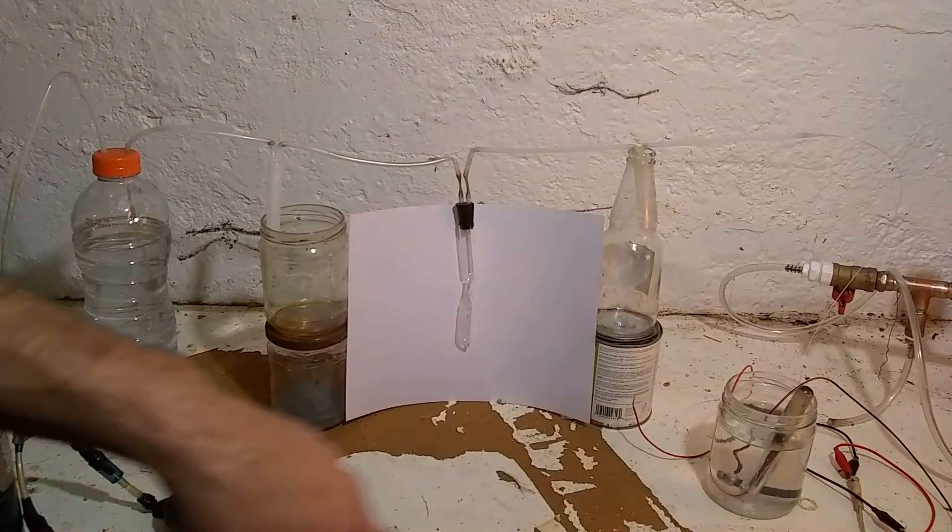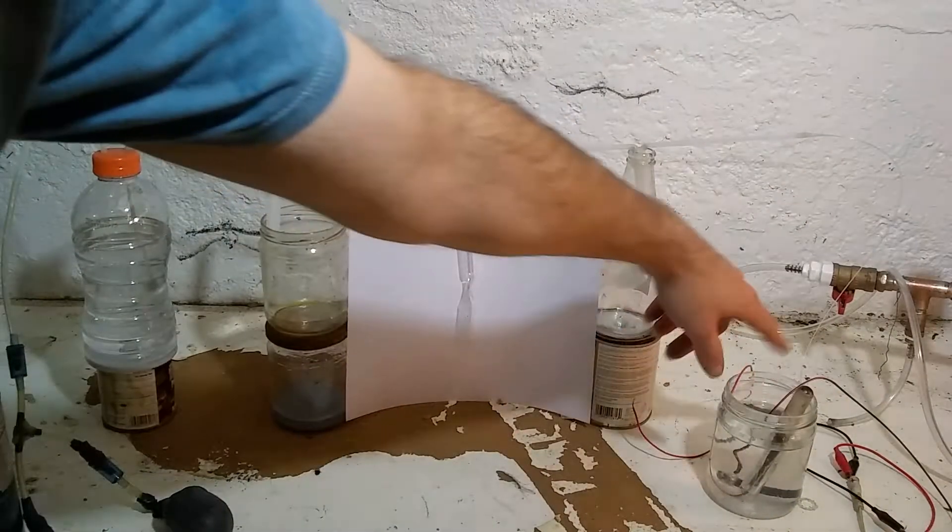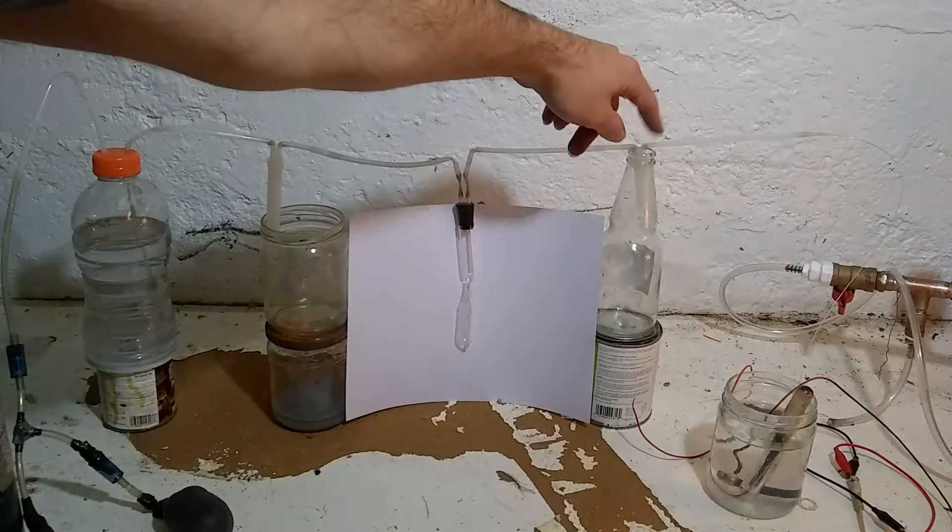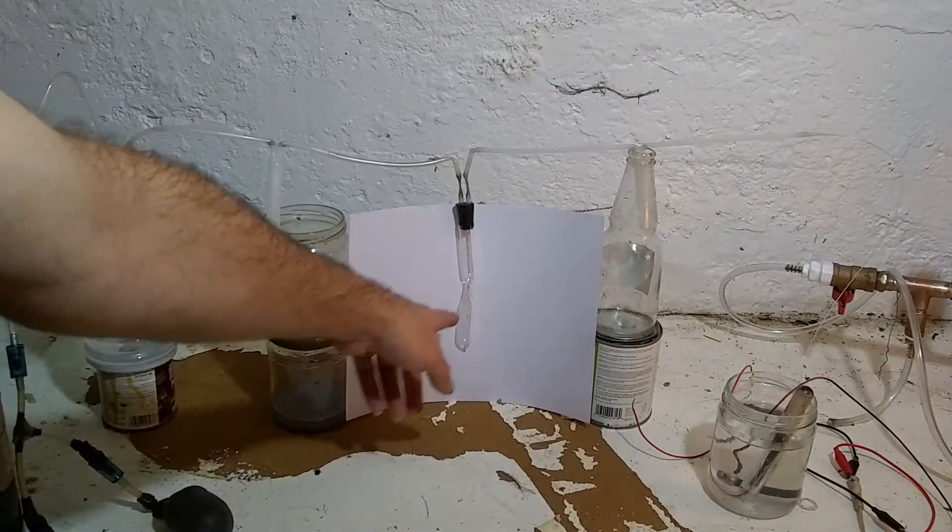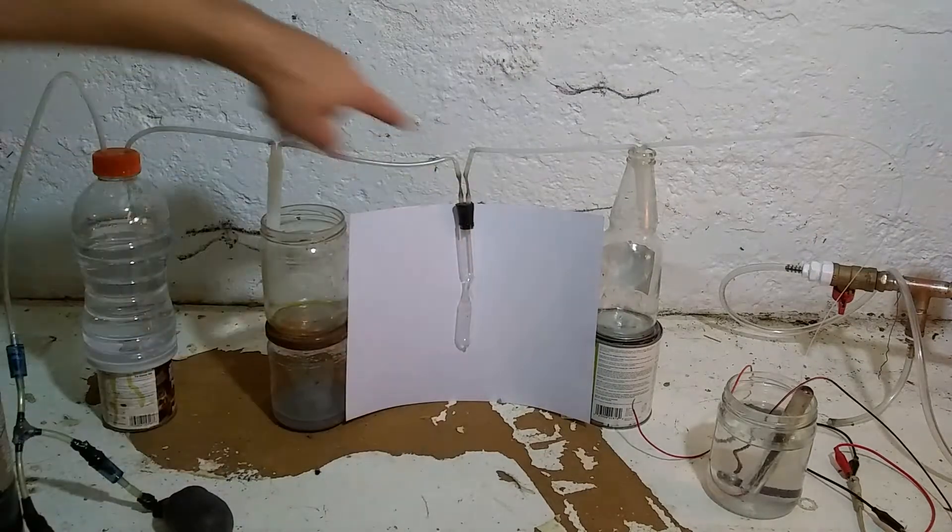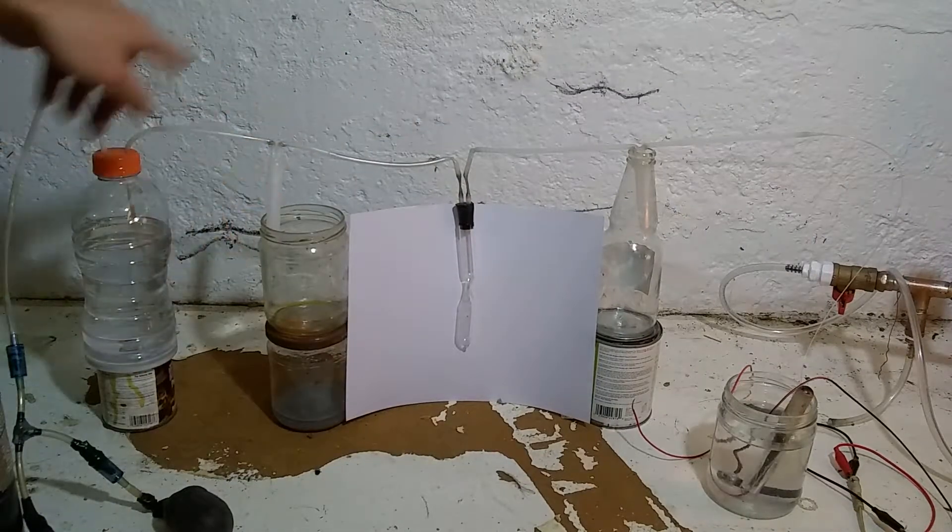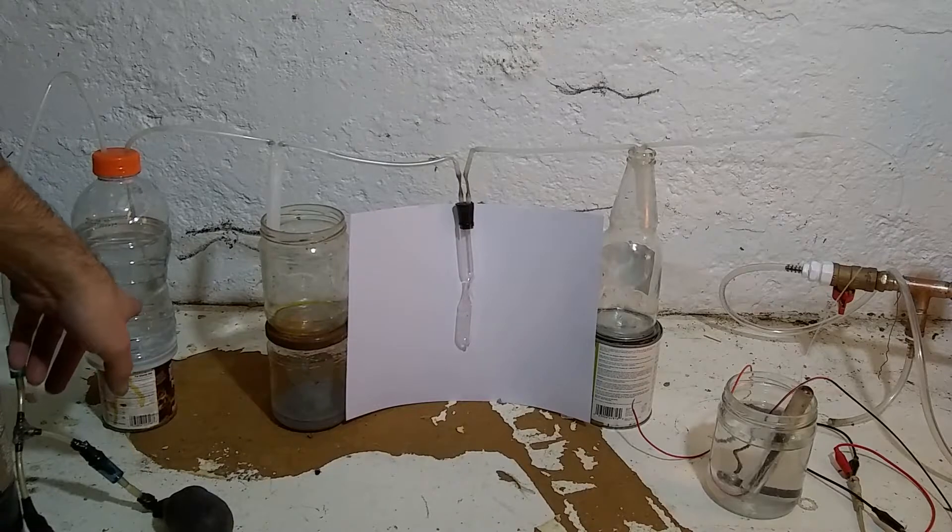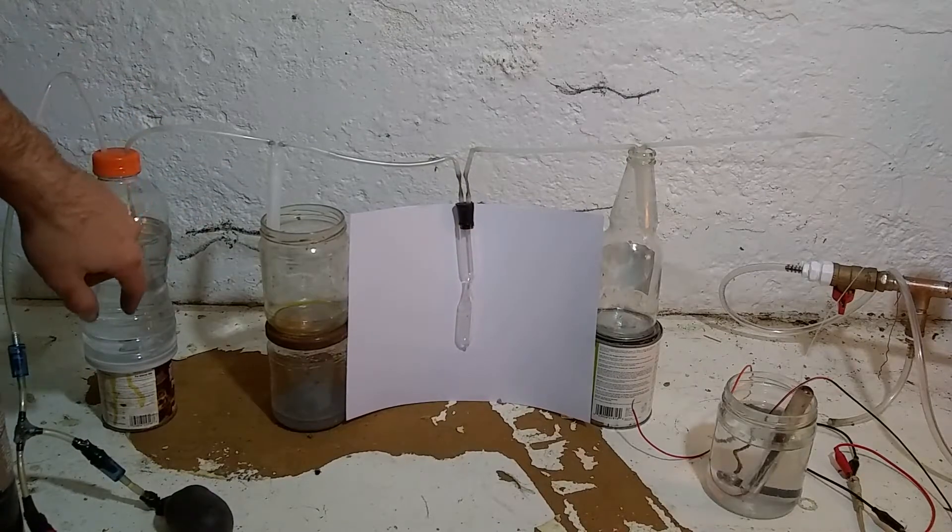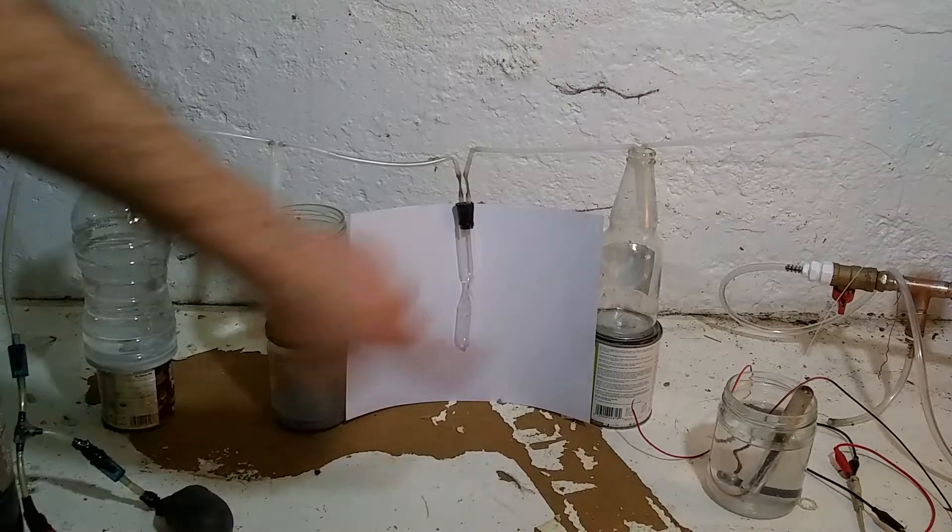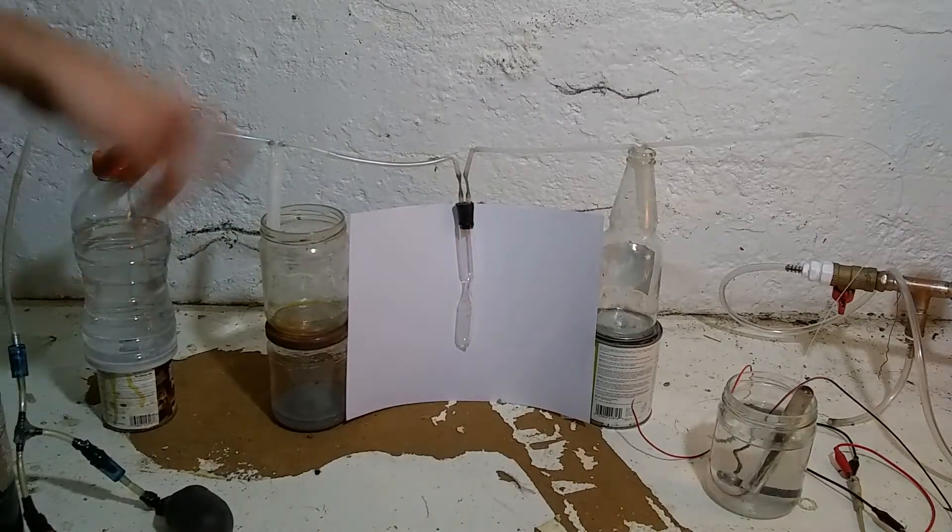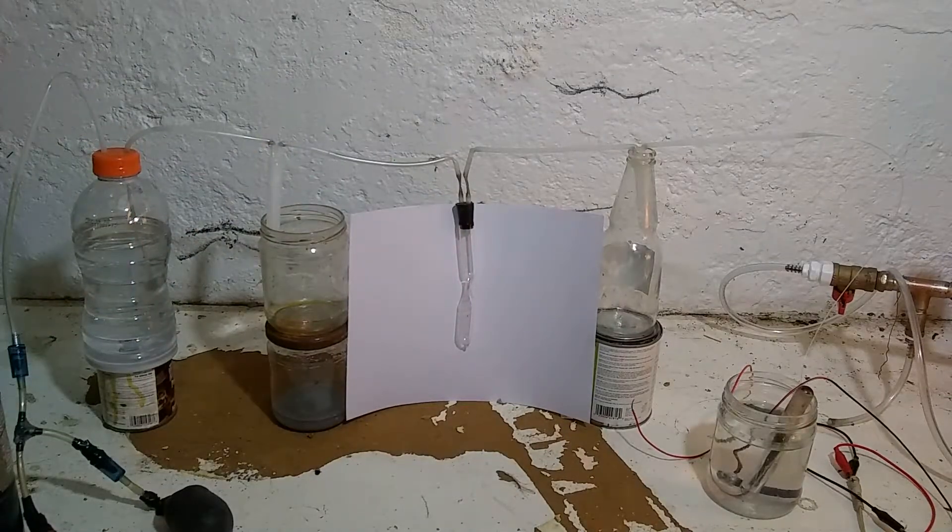Now the thin plastic tube goes up here into the first liquid trap, then in here to the ampoule to collect the chlorine, into the second trap, then into the final, I've been calling this a trap, it's a scrubber. And that will convert any chlorine that gets passed here into bleach.